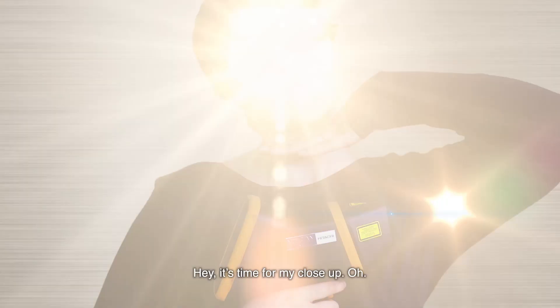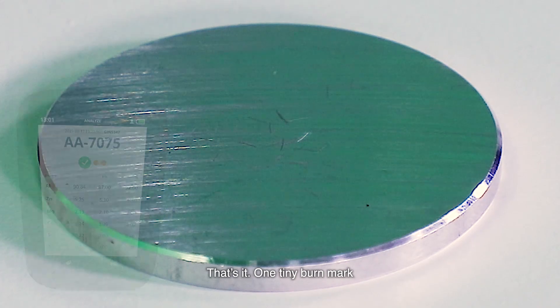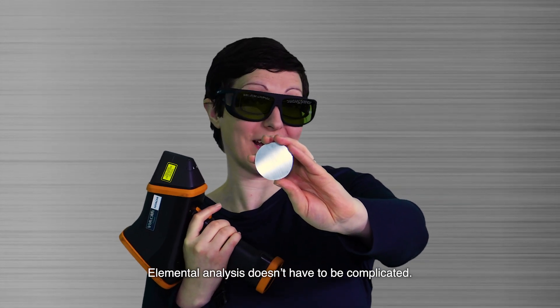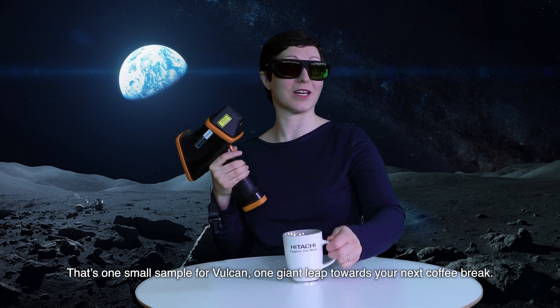It's time for my close-up. Here we go — yeah, that's it. One tiny burn mark and you've got all the data you need. Elemental analysis doesn't have to be complicated. I mean, it's not rocket science, is it? That's one small sample for Vulcan, one giant leap towards your next coffee break.